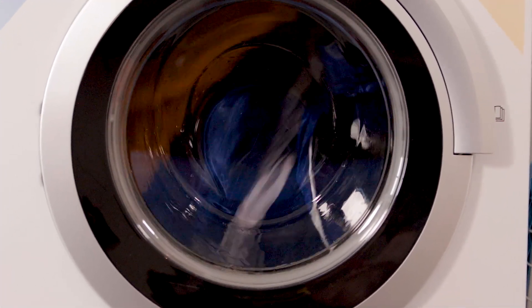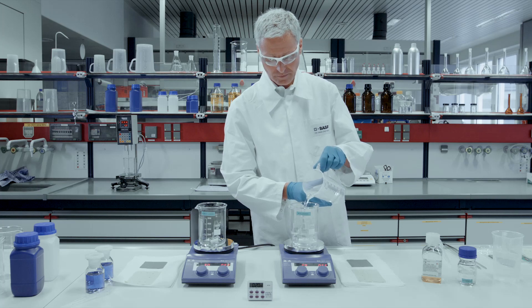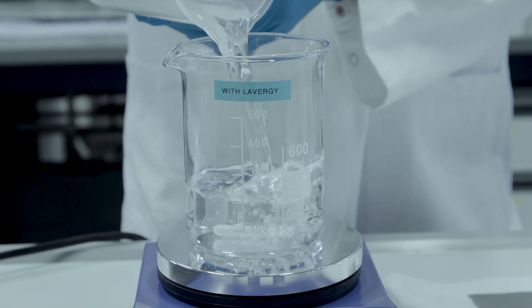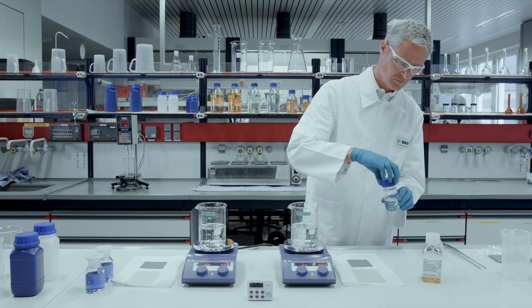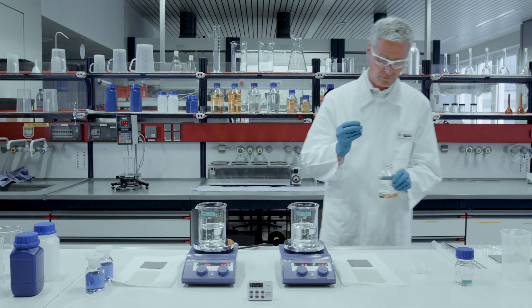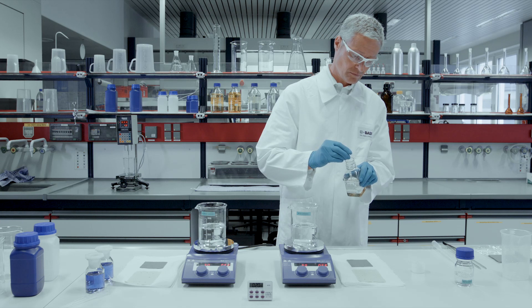How exactly do the Lavergy Pro enzymes work? Two glasses are filled with water at a temperature of 20 degrees Celsius. The same amount of liquid detergent is added to both glasses. In addition, a few drops of Lavergy Pro is added to the glass on the right.